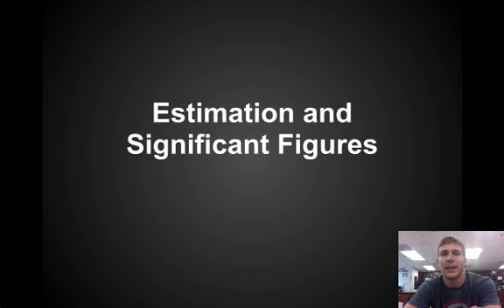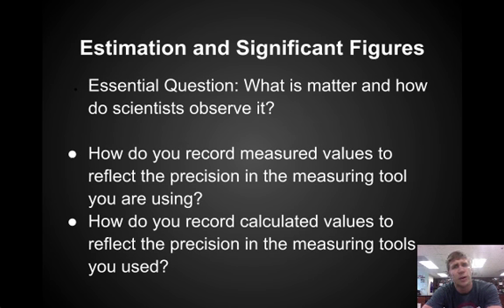Hey guys, Mr. Smine, and today we are going to talk about estimation and significant figures when we're using measuring tools in the lab. So in this video we're still working on the essential question of what is matter and how do scientists observe it.